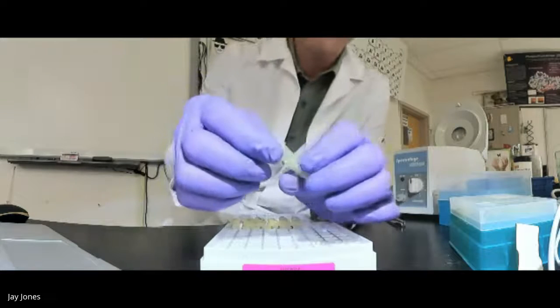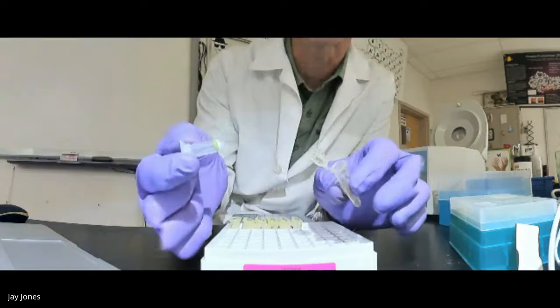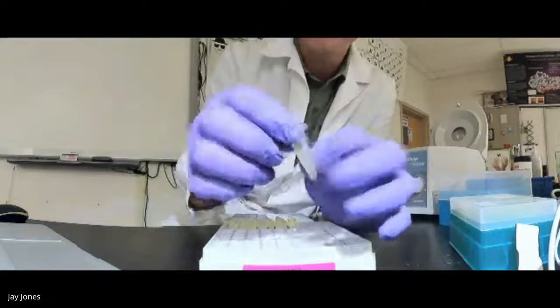So now I don't want the column. The column's done. The column has been robbed of its plasmid DNA. It was holding it for so long, now it's done. I'm gonna toss the column, close the top.